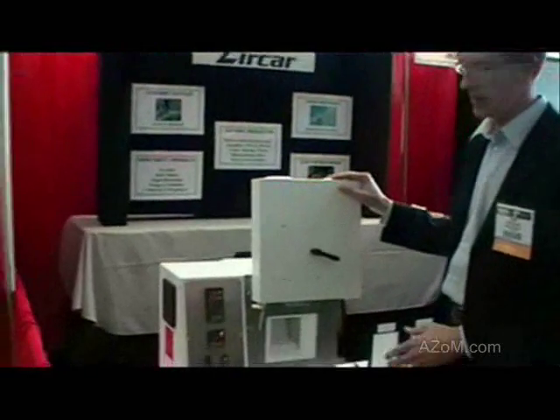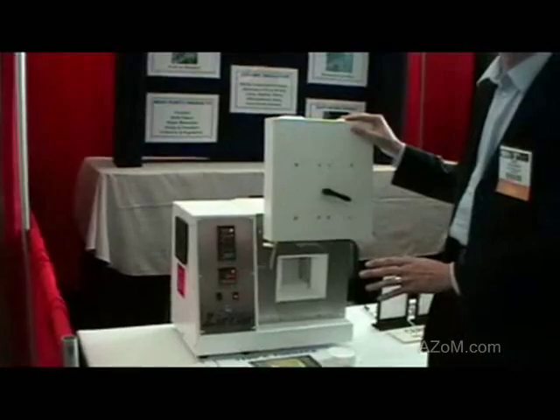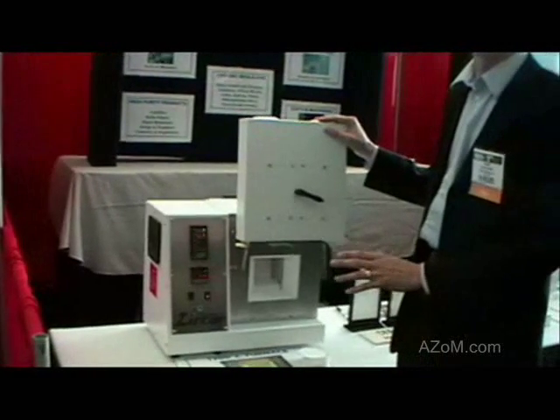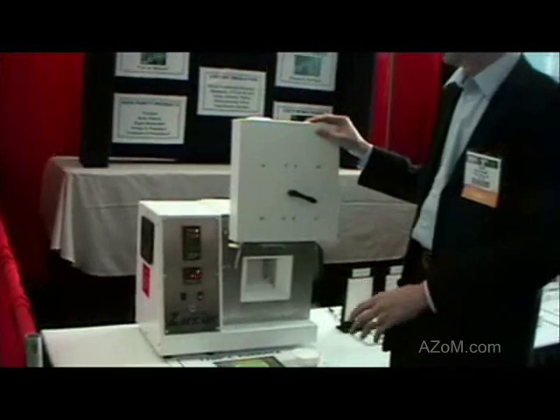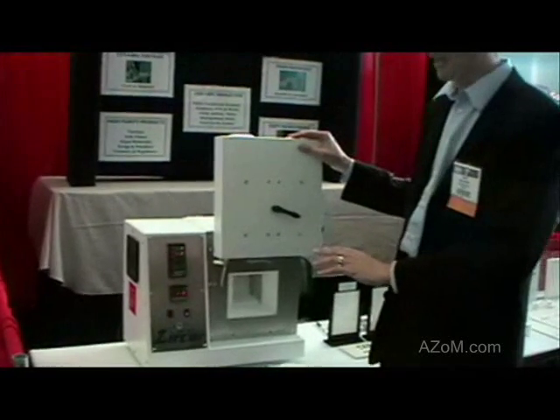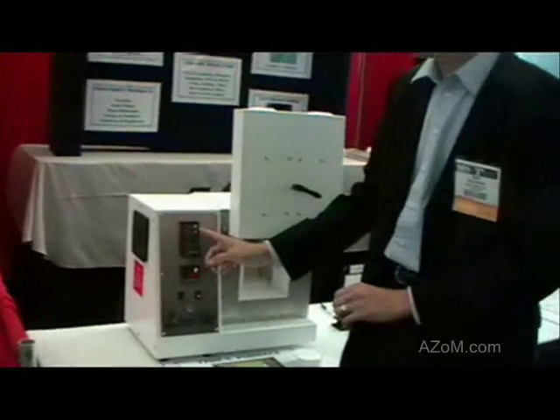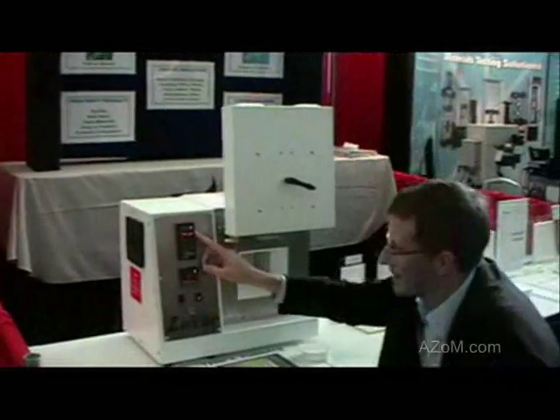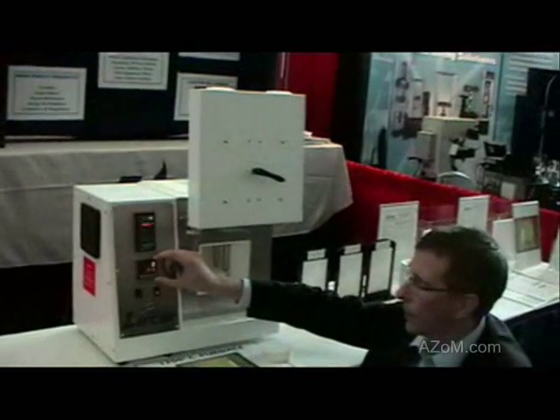What's unique about this is that it's a small, tabletop, 110-volt furnace that will take you to 1700°C. Normally, these are much larger, 220-volt systems. It's also quite economical given its size. It has a programmable controller which holds two programs of eight steps, and it has an over-temperature controller that prevents the temperature from running away.